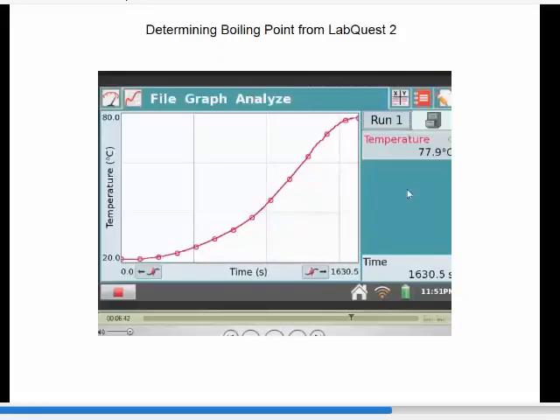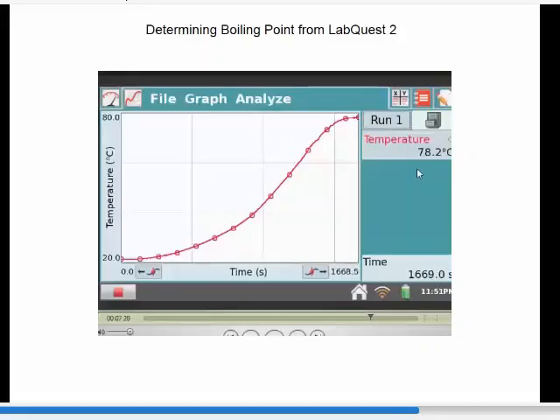If we kept this going for a long time, all the liquid in the test tube would evaporate. It would be gone. The temperature would be 77. It's a fairly good way of finding my boiling point. We use this kind of process in distillations in organic chemistry, where they can separate different boiling compounds from one another based on their boiling point. And refineries. You see those big towers in refineries. You're taking the crude oil and you're separating the different components that have different boiling points. This guy's settling in about 78.2, somewhere inside of there.